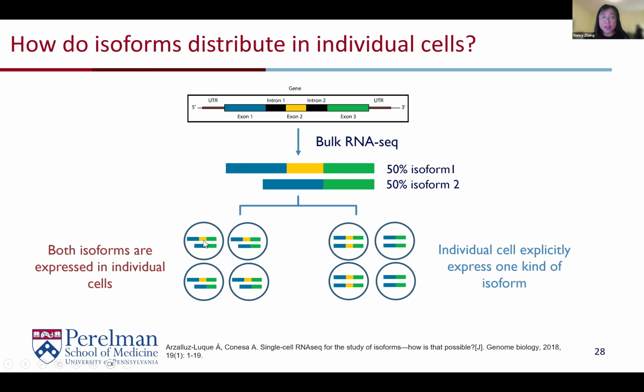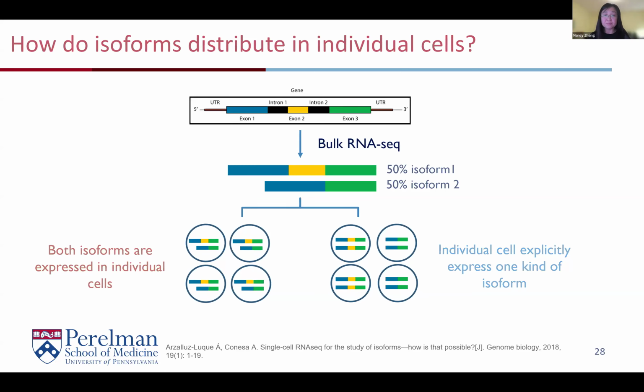And then on the left here is high intra-cell heterogeneity. Intra-cell meaning there's high heterogeneity within the cell. Here is high heterogeneity between cells. Both have their biological interpretations.